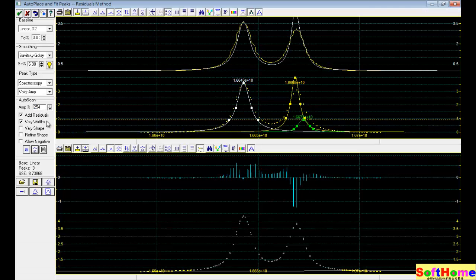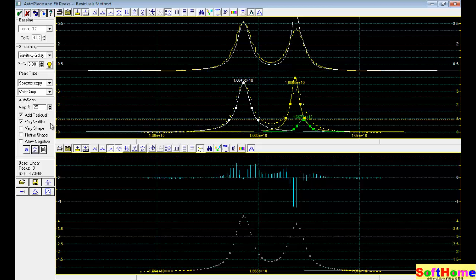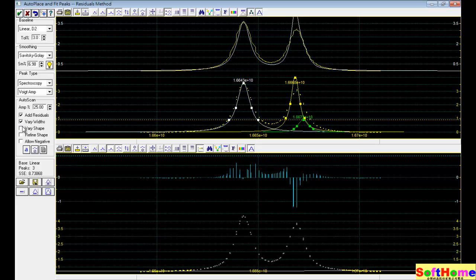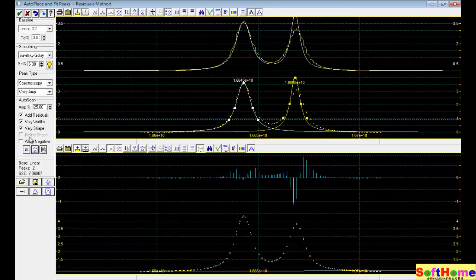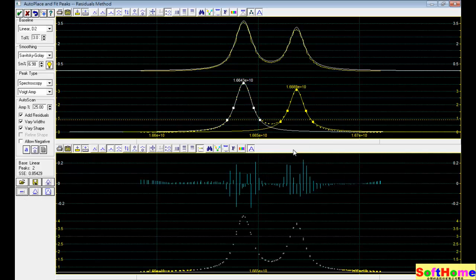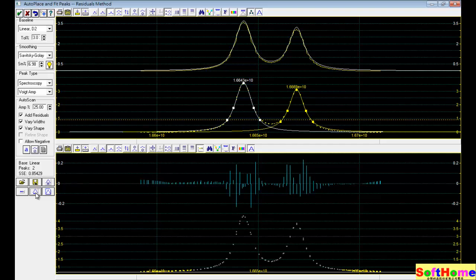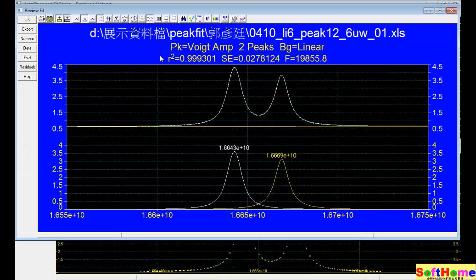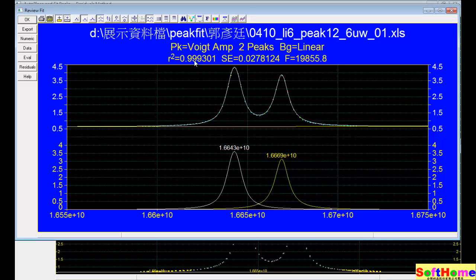Now show the automatic. And adjust. And 21% threshold. After automatic adjust, you can see the, you can review the R2. Very, very, very high. And quite perfect.